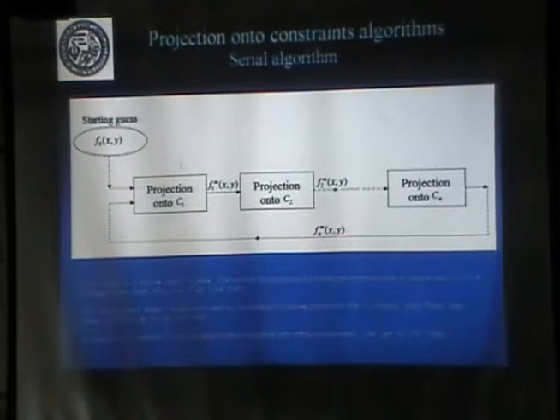One type of algorithm is what is called projection onto the constraints. This is when you don't know how to do things, you just do it. And normally it works. You say, well, I want some condition to be satisfied. Okay, I'm imposing this. And then you impose the next condition, and the next condition, and you iterate. And eventually those things converge in some circumstances.